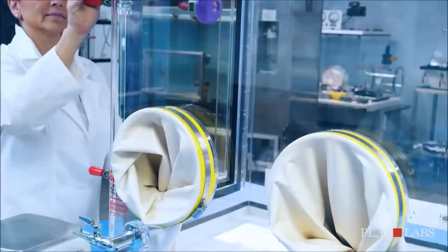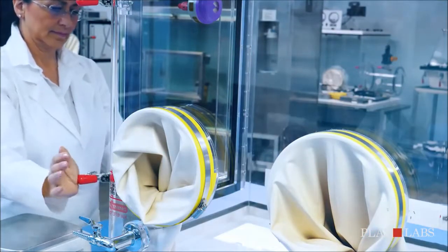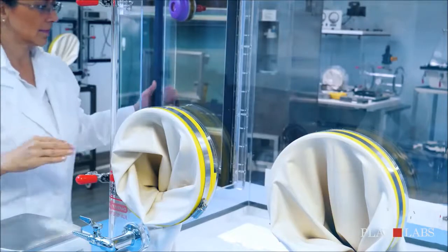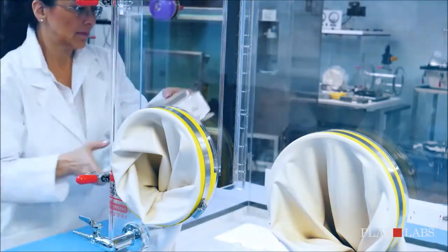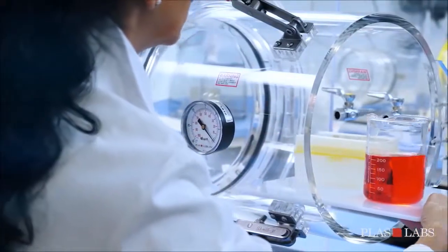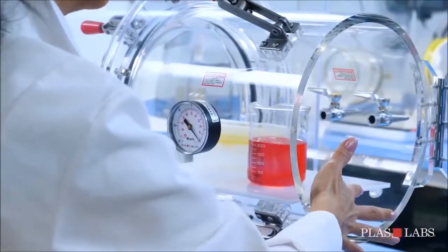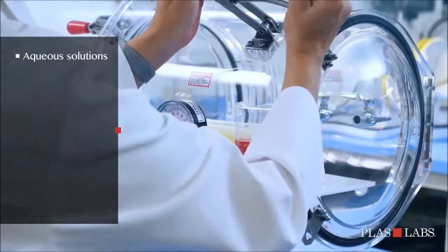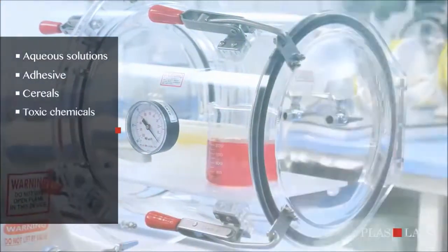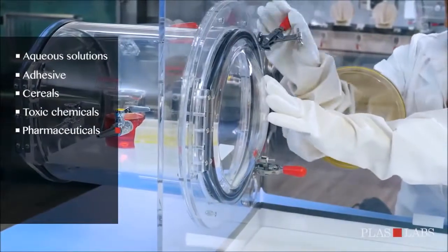All units feature high visibility of the interior, cleanliness, safety, complete containment, portability, and a draft-free atmosphere. The chamber is ideal for determining the dry weight measure or moisture content of aqueous solutions, adhesives, cereals, toxic chemicals, pharmaceuticals, paper, plastics, and light radioactive materials.